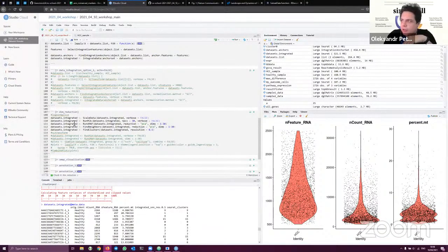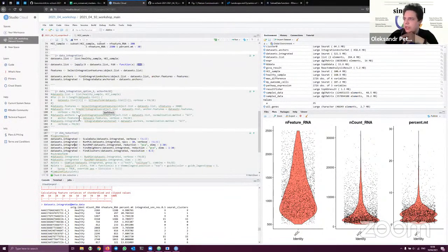However, another topic. The next step we should usually do in the standard workflow is to reduce the dimensionality, meaning that we have this, even normalized, big matrix with genes and the cell names, right? So I think we can actually try to take a look at that.